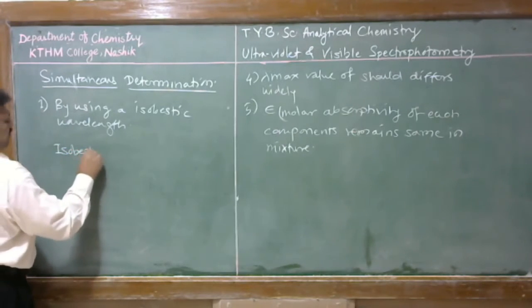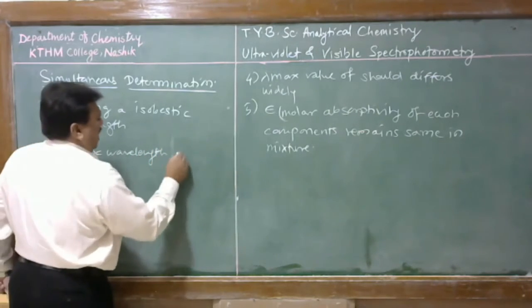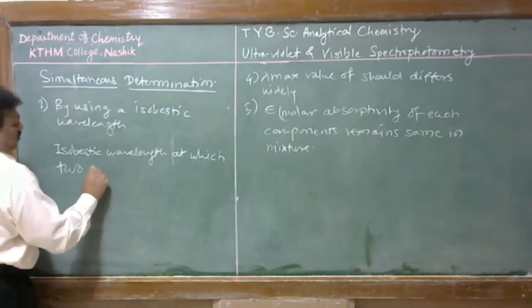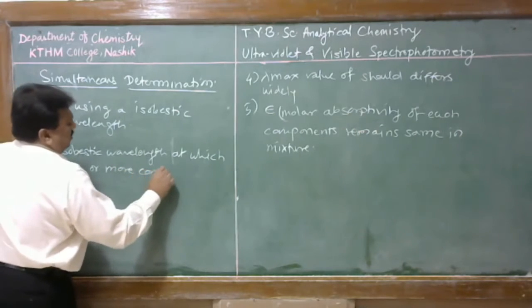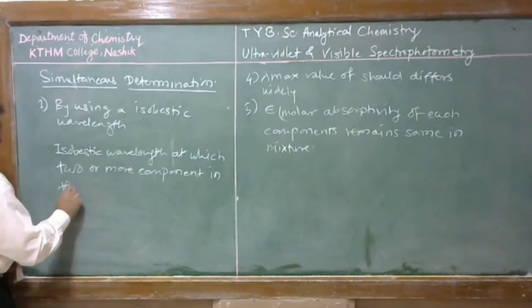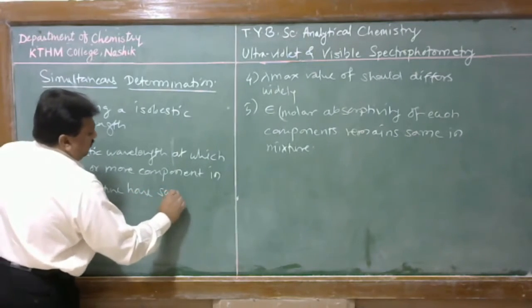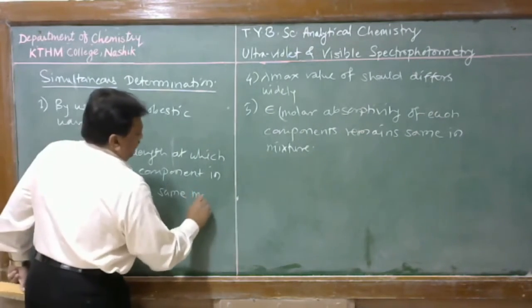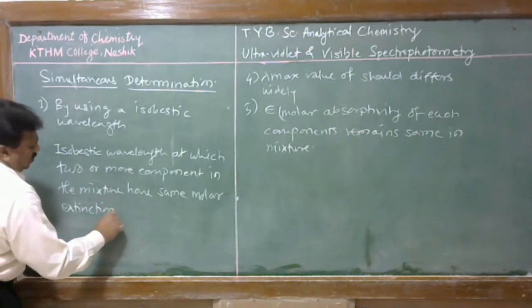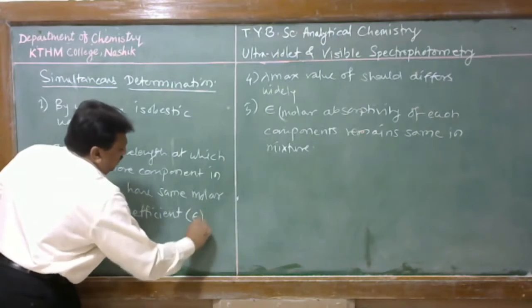That is, the wavelength at which two or more components in the mixture have the same molar extinction coefficient, or epsilon value.